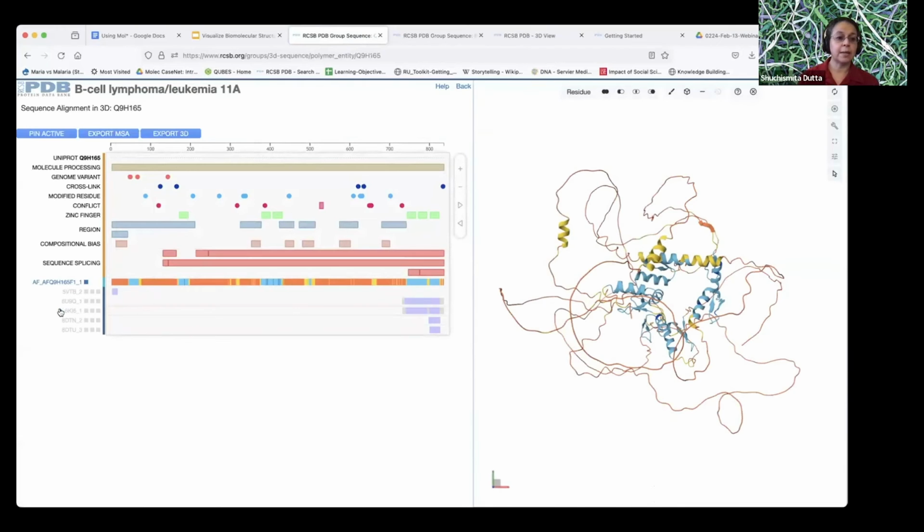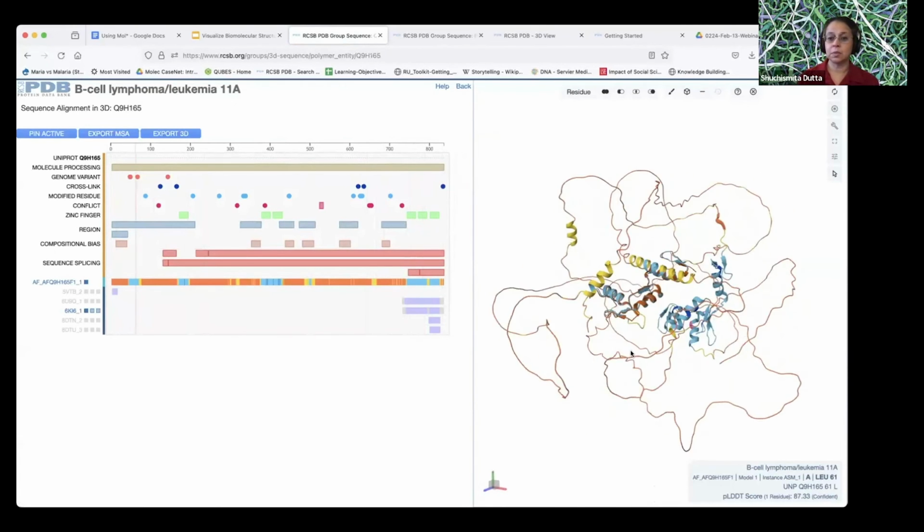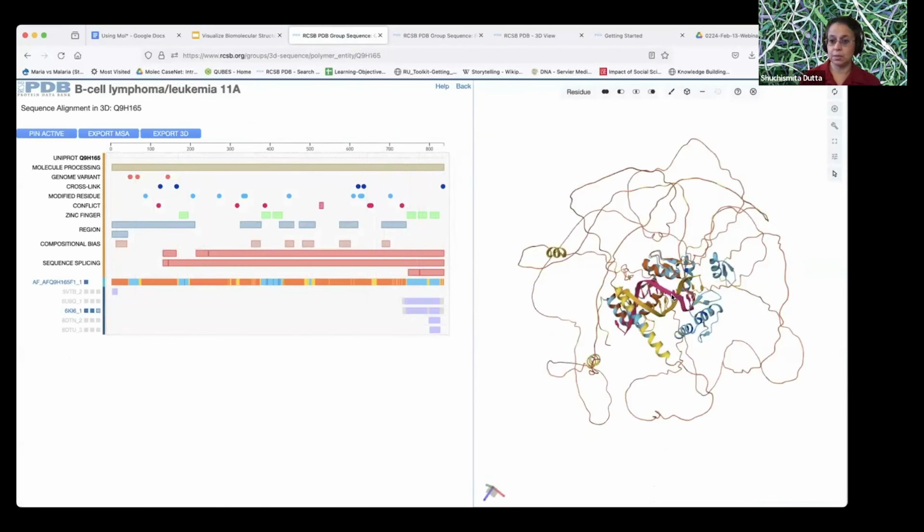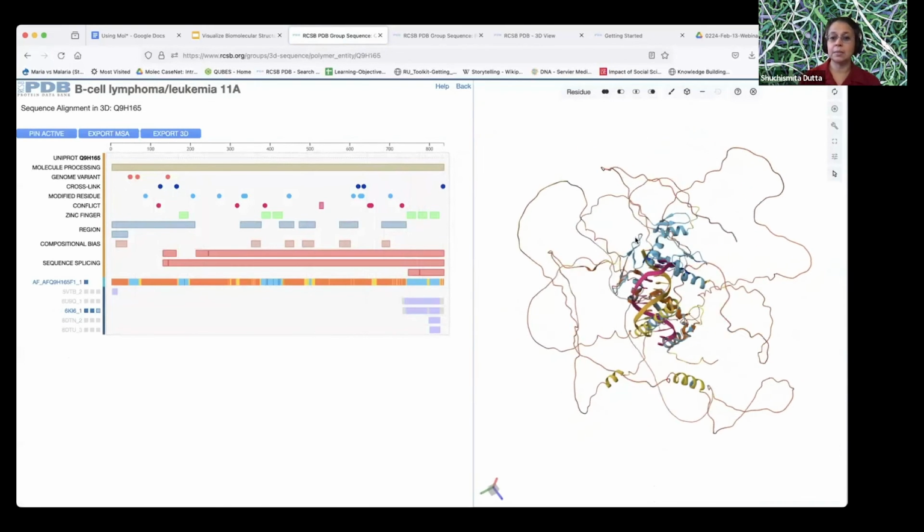And on top of that, I can display this particular structure that we were looking at a few minutes ago. Now, the value of a display like this is I can then say, okay, show me where my polymer chains are. So in this particular structure, we had DNA bound.